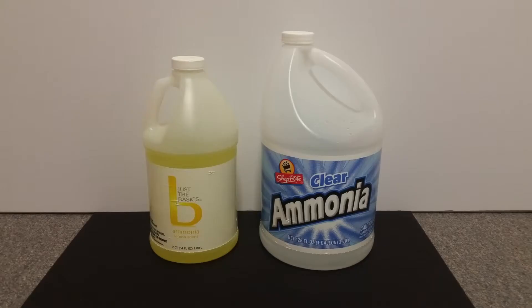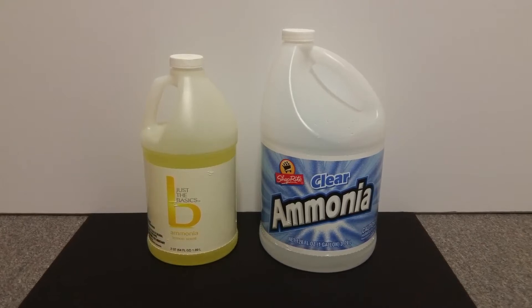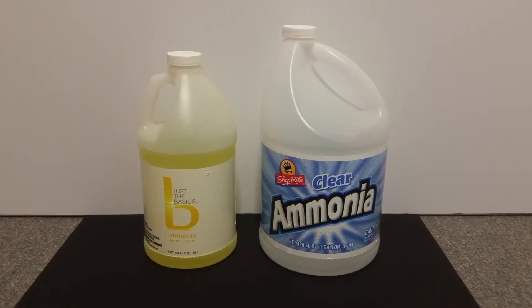Ammonium hydroxide is an extremely useful base with many real-world and laboratory applications, including the production of hydrazine, phenol, urea, amino acids, and even in the production of Schweizer's reagent.